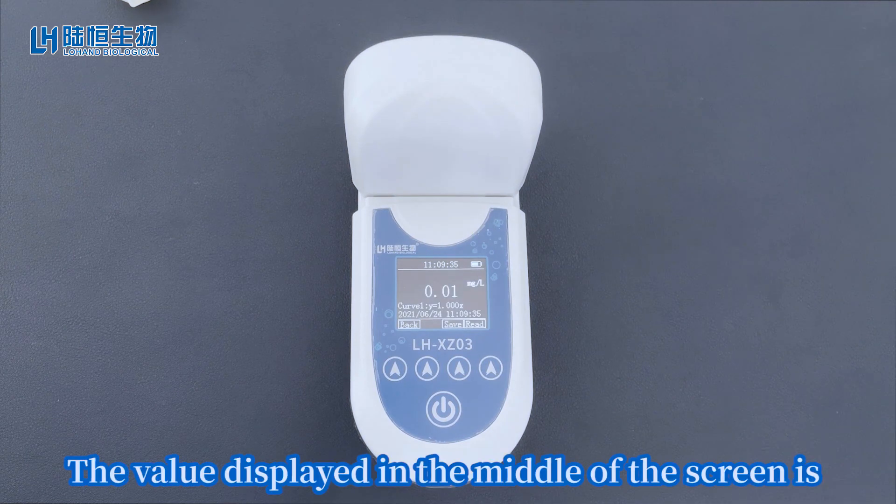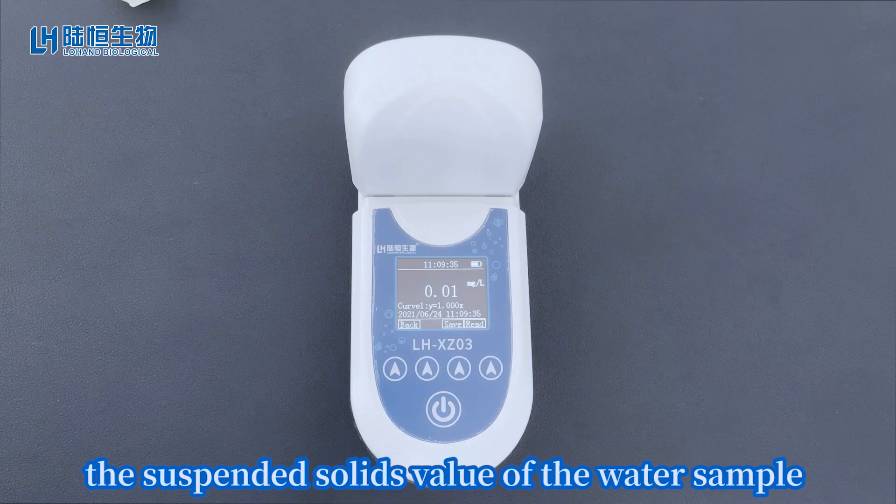The value displayed in the middle of the screen is the suspended solids value of the water sample.